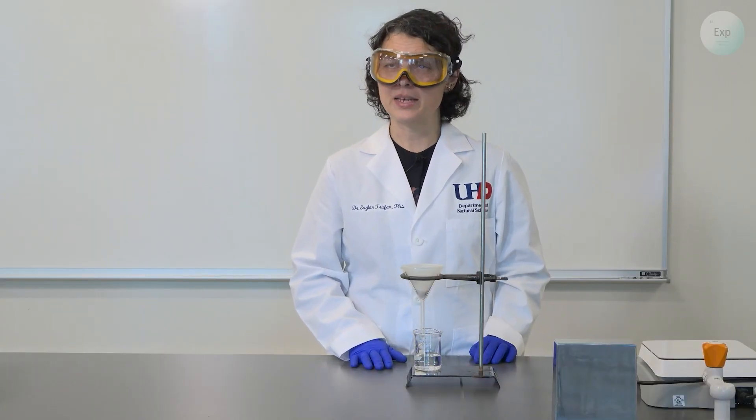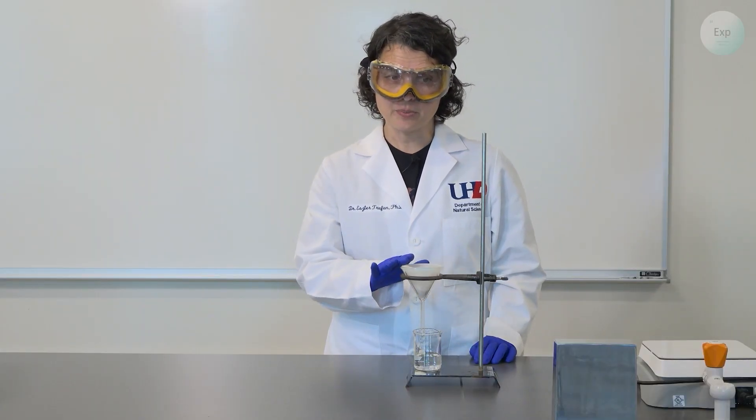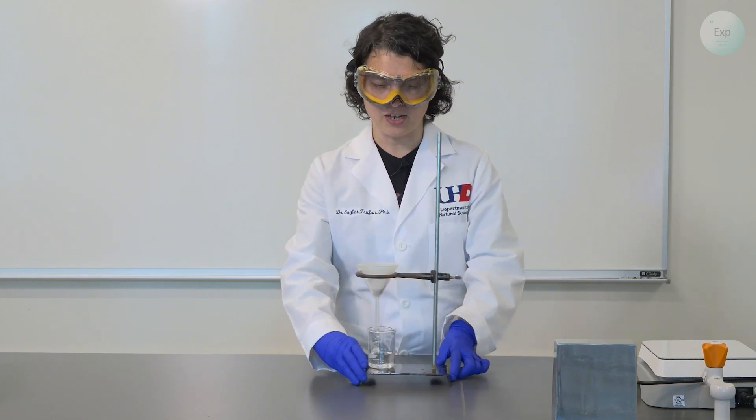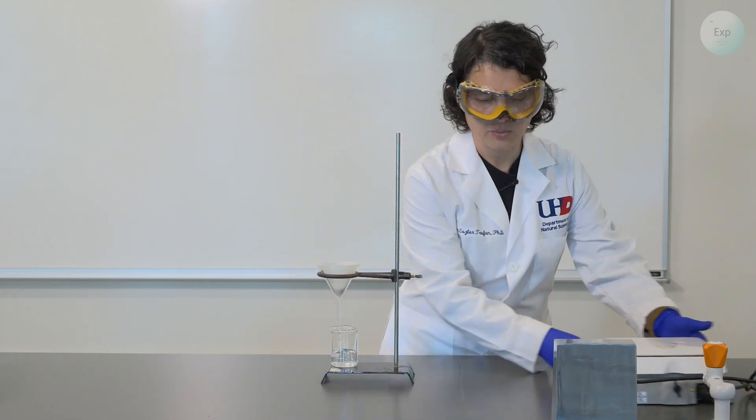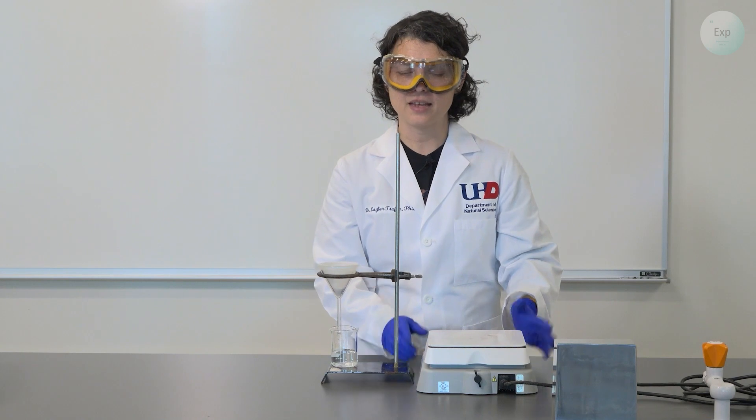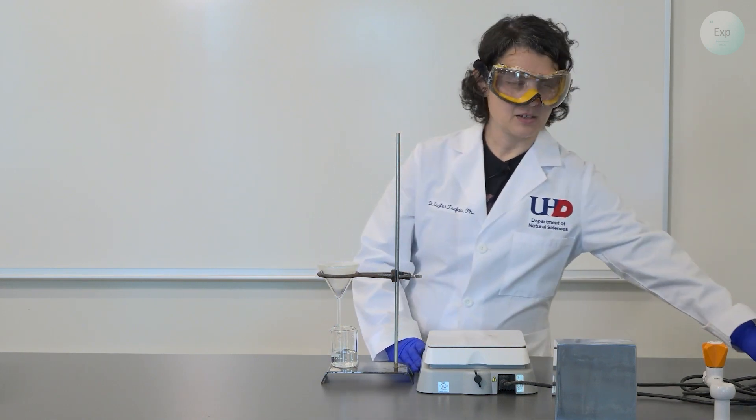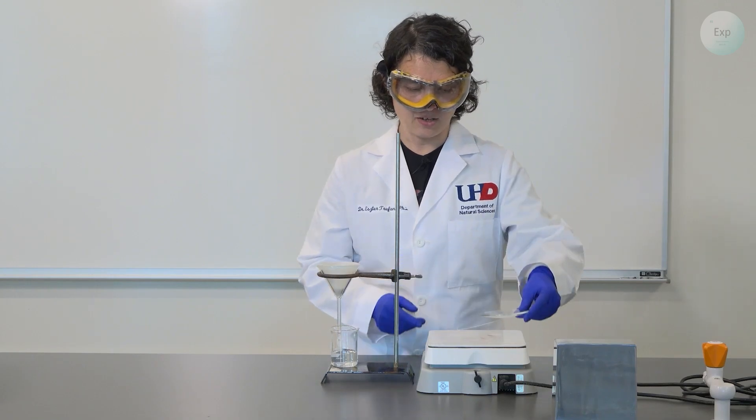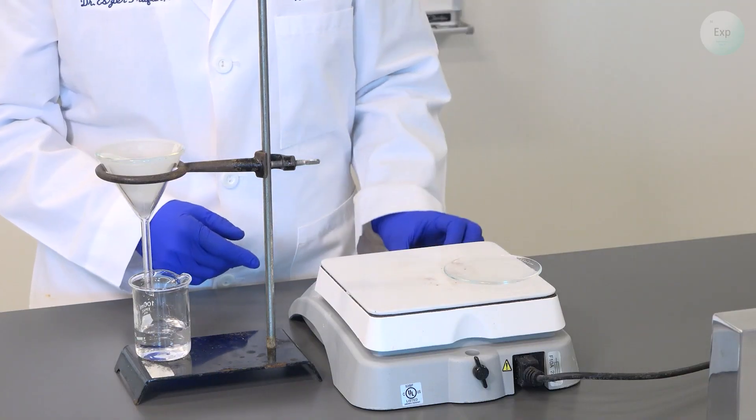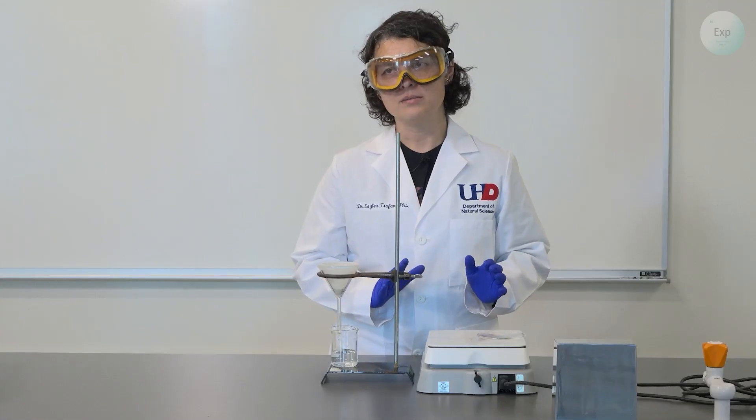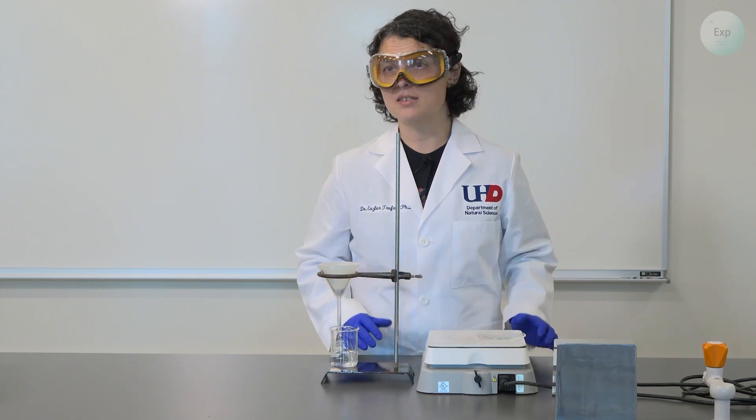From here we can start the extraction process. The filter paper needs to be dried. So for that, we will need a source of heat, and for us it will be a hot plate. To get it dry, we're going to place it on a watch glass on top of a hot plate, and this should be set to a medium-low temperature so that it does not burn the paper.